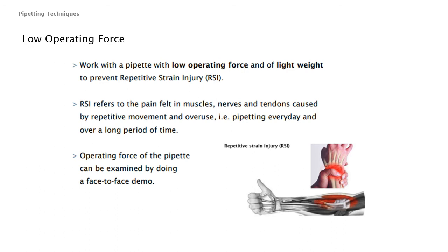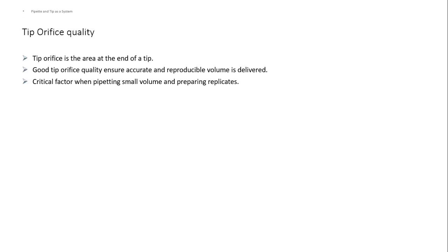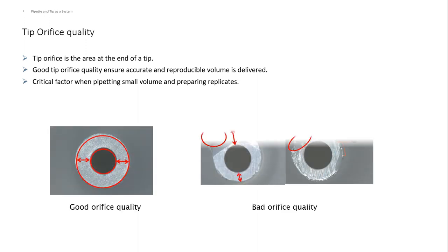So it's a good choice. Now let's go to pipette and tip as a system. Don't be confused by this one. Many pipette brands declare that they have a soft open system, meaning their pipette is compatible with other brands of pipette tips.